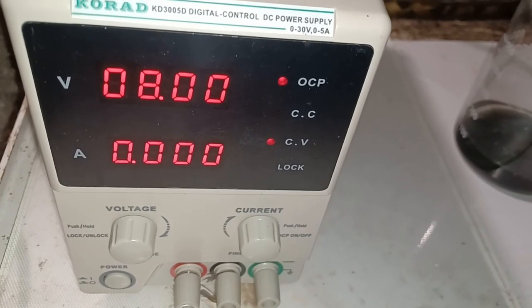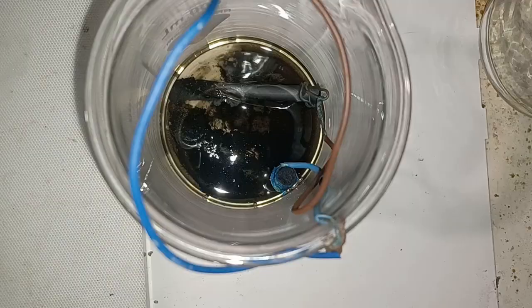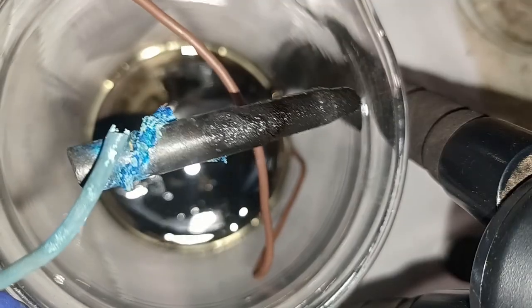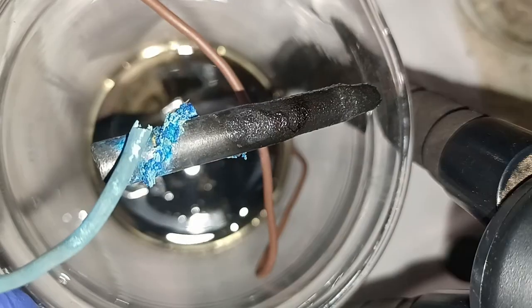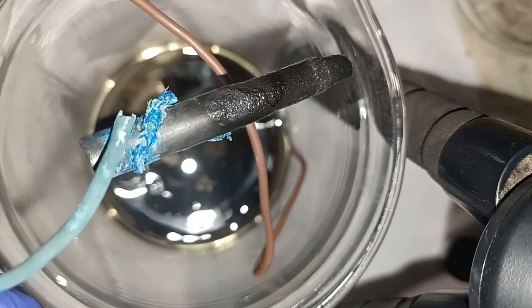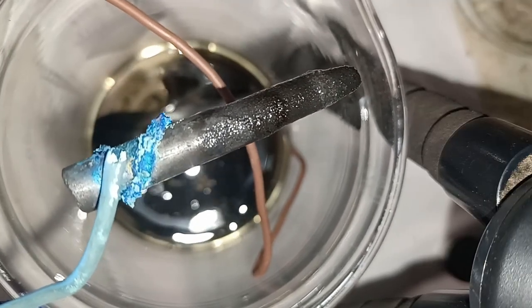After current fell to zero, I disassembled the cell. Here you can see what the ammonia vapors have done to the exposed copper wire. That's some pretty colors, but not the best practice, because those crystals can fall into the solution and contaminate the product.